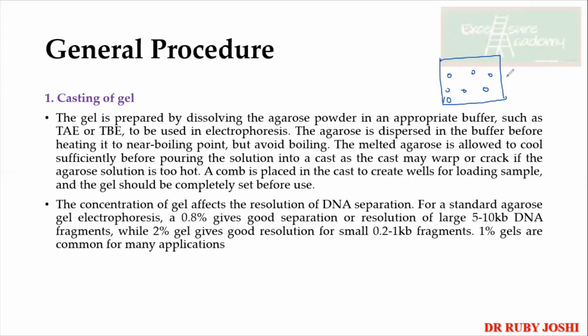How is it going to affect? The pore sizes will be different throughout where the bubbles are there. There'll be no friction where the bubbles are, but where there is friction, that will affect how the sample runs. Yes. See, the thing is that it is going to make a gap.